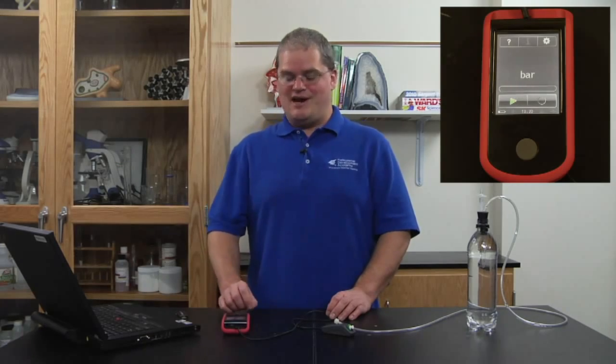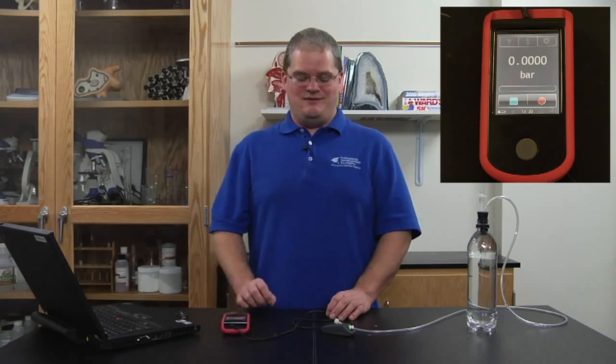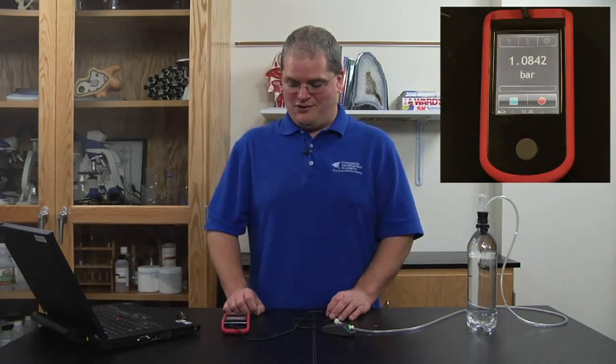In order to begin measuring data, you want to push the green button on the home screen and you'll immediately begin to measure the gas pressure of the room. Currently, you can see the gas pressure in the room is 1.08 bars.